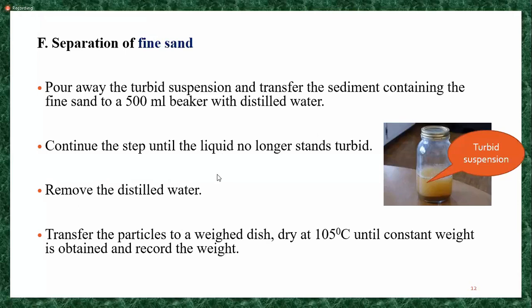For this also you have to take the sample and transfer it into the moisture can or the crucible, and put it in the oven to get the oven dry weight. While seeing the readings, you will get an idea. Let me move to the next slide.